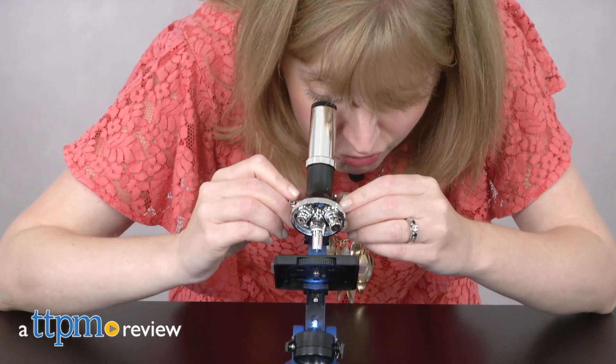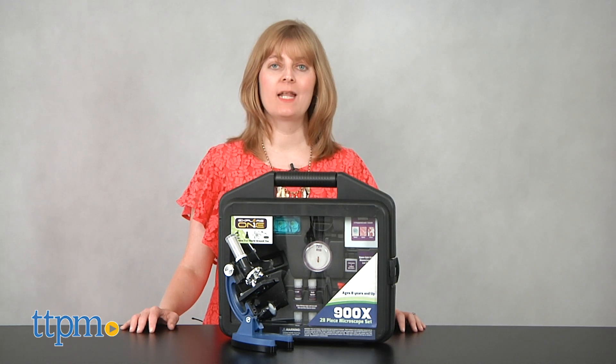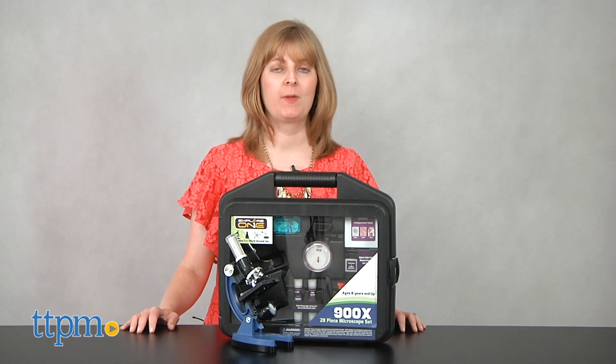Help curious kids explore their world. Hi, I'm Laurie from TTPM, here with the Explore One 900x Microscope from Explore Scientific.